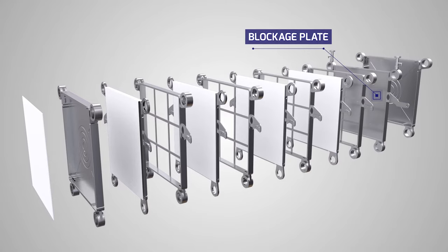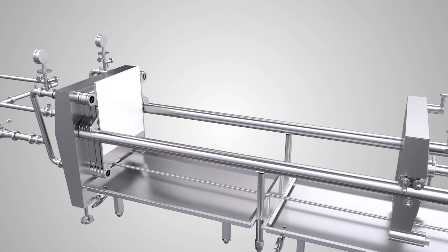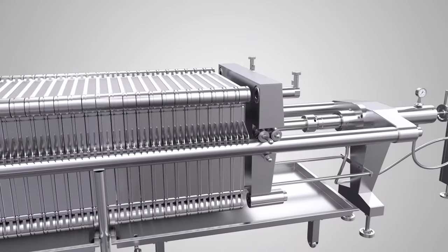It consists of plates, frames, screens, drip tray, pipe manifold, valves, and filter papers, all mounted on a chassis, assembled using a hydraulic closing device with preset pressure.